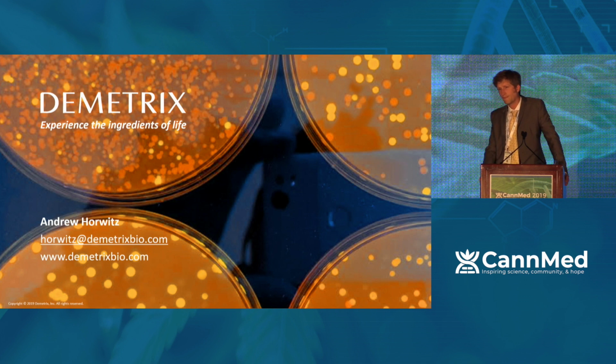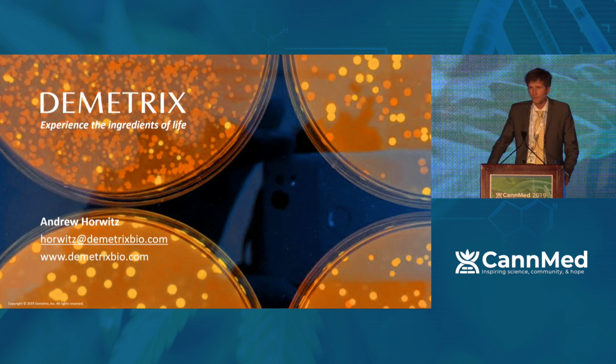You mentioned that you're in the scale-up phase, scaling up the amount of product that you're making. I've seen in literature in the past that there are issues with cytotoxicity with some of the cannabinoids that are produced, at least the terminal cannabinoids. Is that something you've addressed yet in scalability or have seen one way or the other?